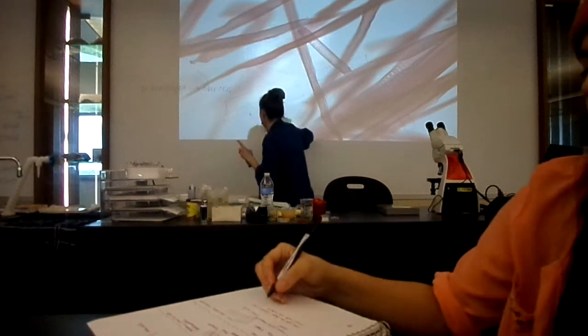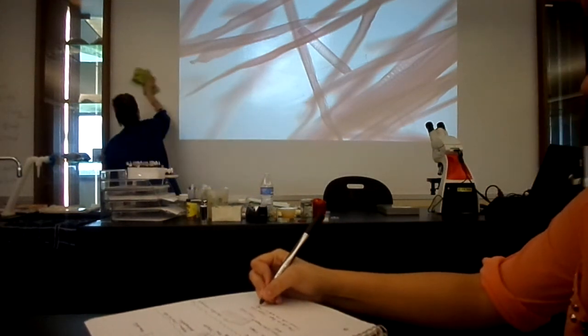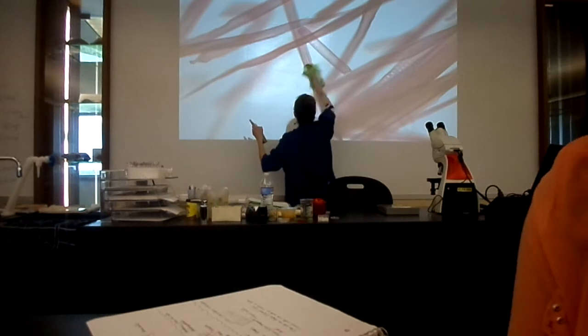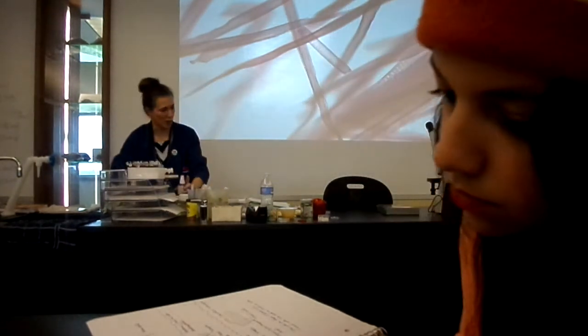So there is another kind of xylem cell. We call them tracheids. We need to look at the slide that says Pinus australis. It's a pine tree. Okay?